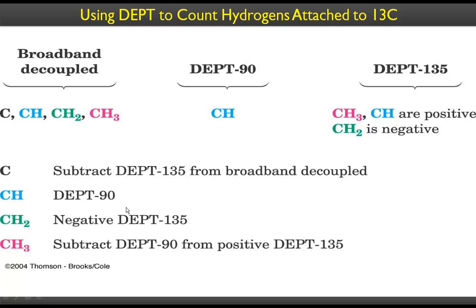Without knowing the instrumentation part, you can just select the experiment that you want. If you want to become a spectroscopic person or scientist, you can learn them in much more detail. Anyhow, if you want to look at the negative peaks, the methylene peaks, you can just run DEPT 135 and look at the negative peaks. That would tell you the number of methylenes. This methylene can be any methylene, right? That has 2 hydrogens. We'll talk about the different types of methylenes.